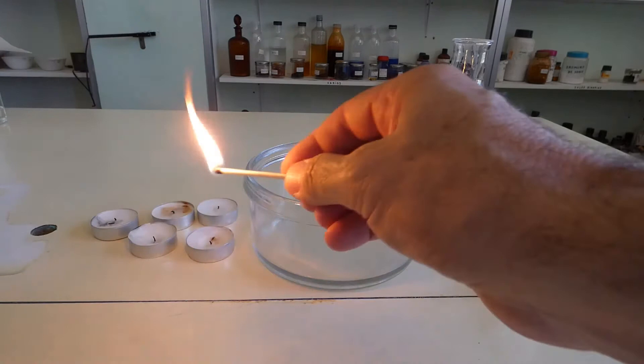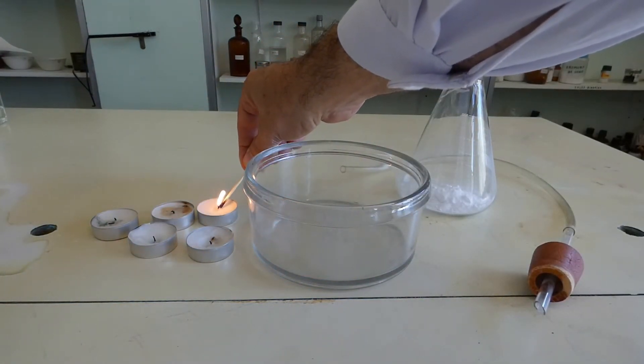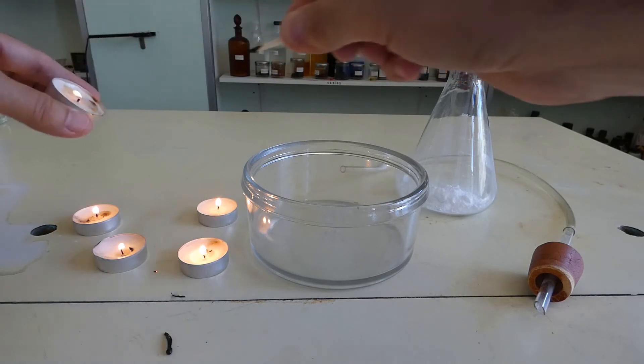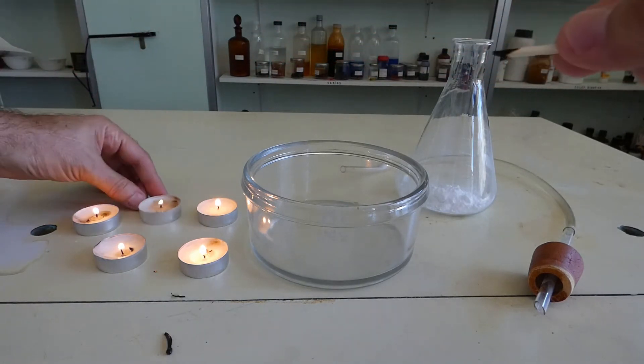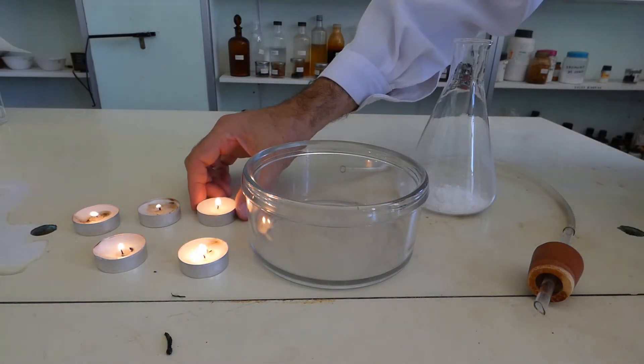Light some candles and put them inside a crystallizer.